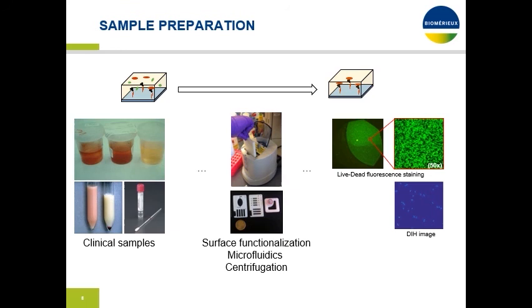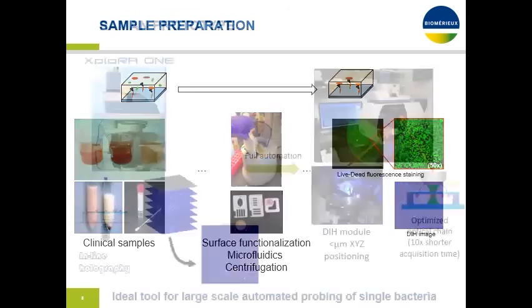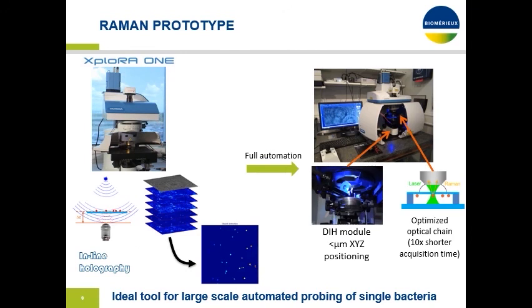This is another picture that is more representative of what you can get. This one is obtained with digital inline holography, and you can see the shape and precise position. So you can probe the different bacteria that have been captured. To do so, we first have to have a refined 3D mapping of those bacteria in order to focus the Raman microscope onto those. To do so, we have chosen to use inline holography.